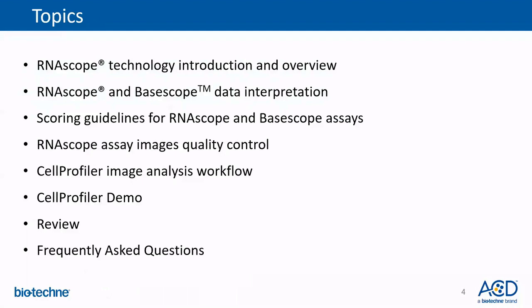Importantly, a tech note will be available shortly on the ACD website, which will contain detailed instructions as well. And we encourage you to become very familiar with the contents of that tech note as a good starting point for using CellProfiler.